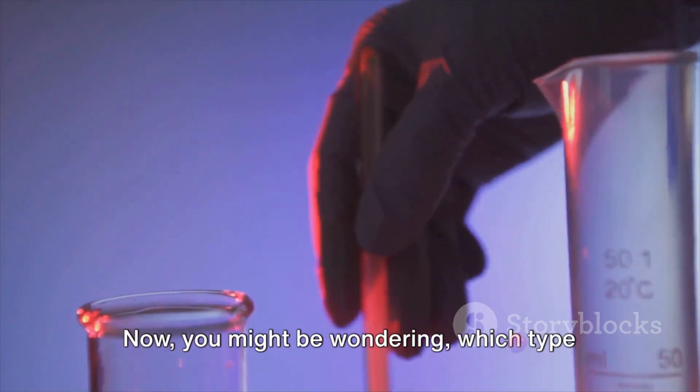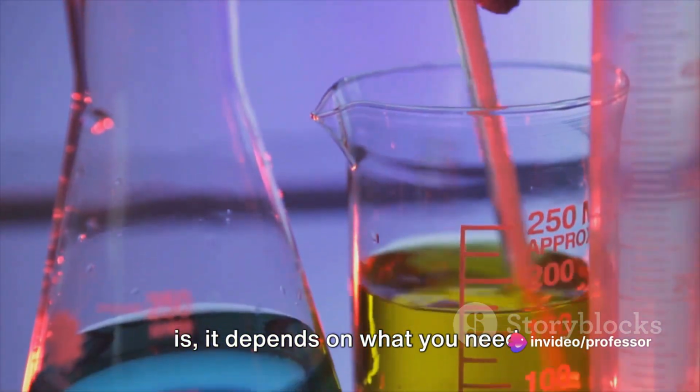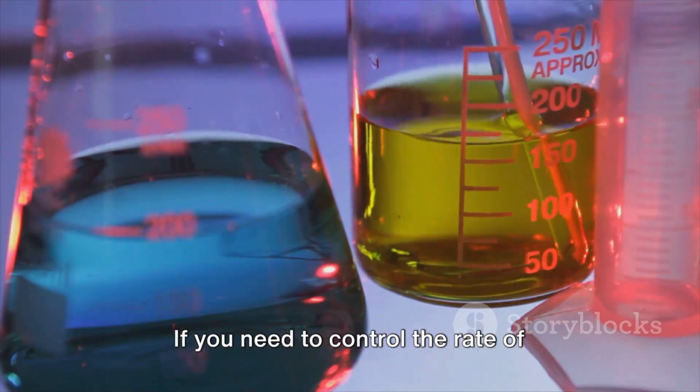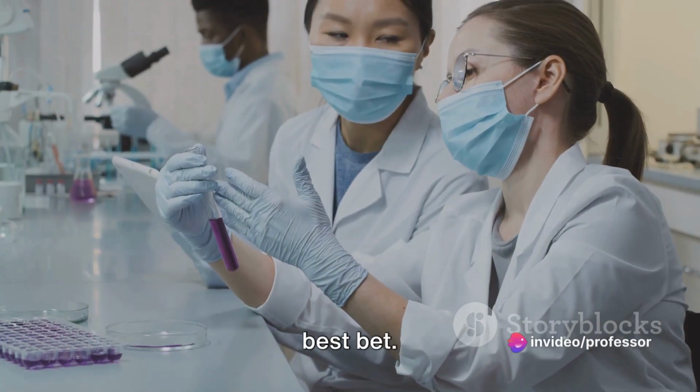Now, you might be wondering which type of coulometry is better. Well, the answer is, it depends on what you need. If you need to control the types of reactions, potentiostatic coulometry is your way to go. If you need to control the rate of reactions, amperostatic coulometry is your best bet.